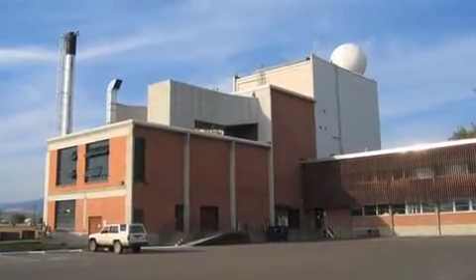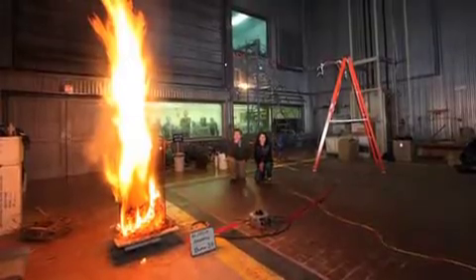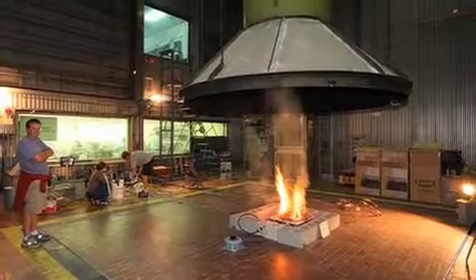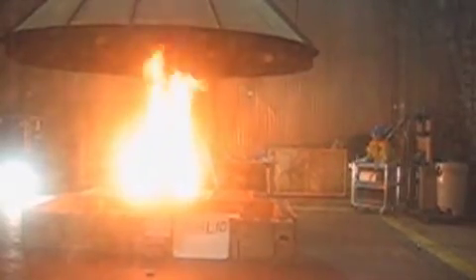One large source of such acids is biomass burning. So we obtained a seed money grant from CIRES to go to the Fire Sciences Laboratory in Missoula, Montana, where you can do controlled fires in the laboratory and study them. And we took our mass spectrometer there to measure what we thought was going to be mostly organic acids.